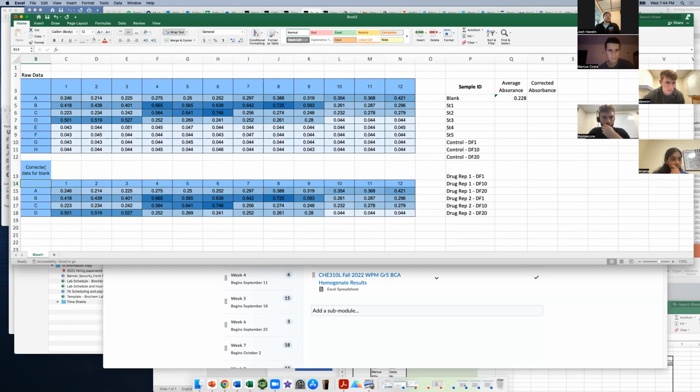Stop helping me, whatever. I'm leaving that alone. Excel's trying to help me.